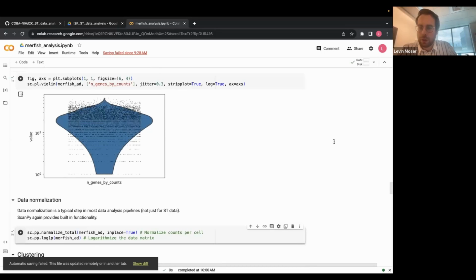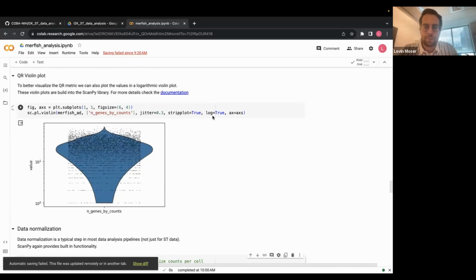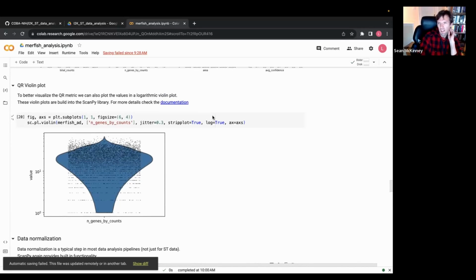Not really sure if I understand your question correctly. Haven't you lost your raw counts if you don't put them into raw? Yeah, so in the versions I've seen online, you have to assign .raw to your original X table, because when you do the normalization, the X table is going to get replaced by the normalized and log values.